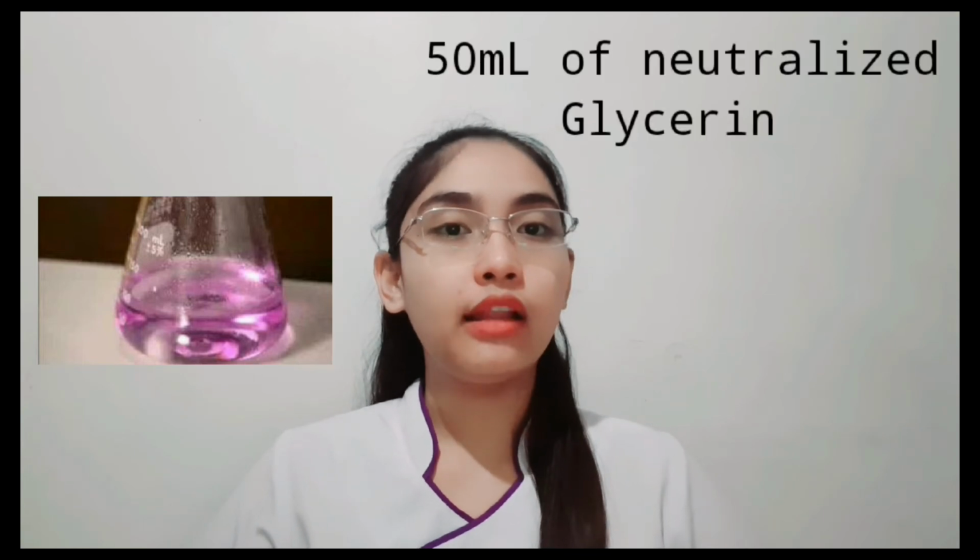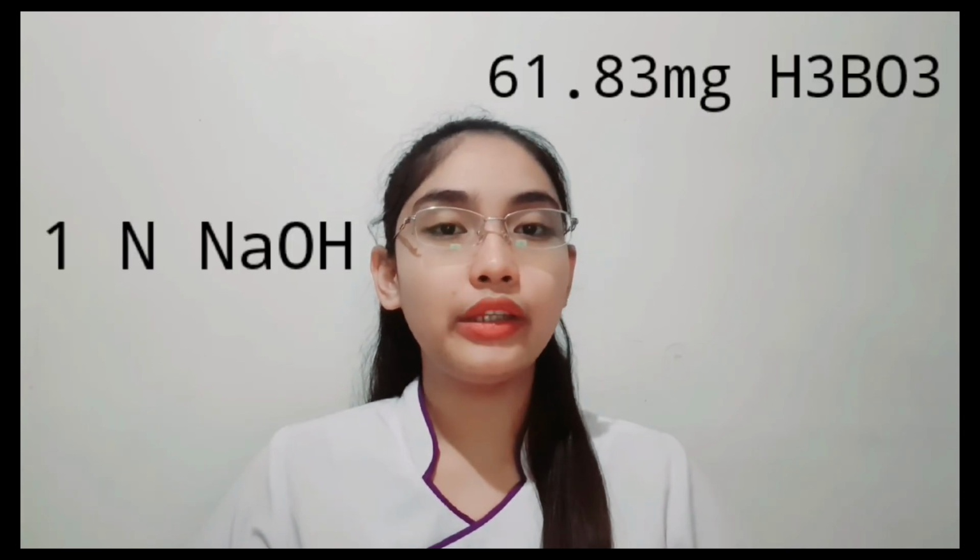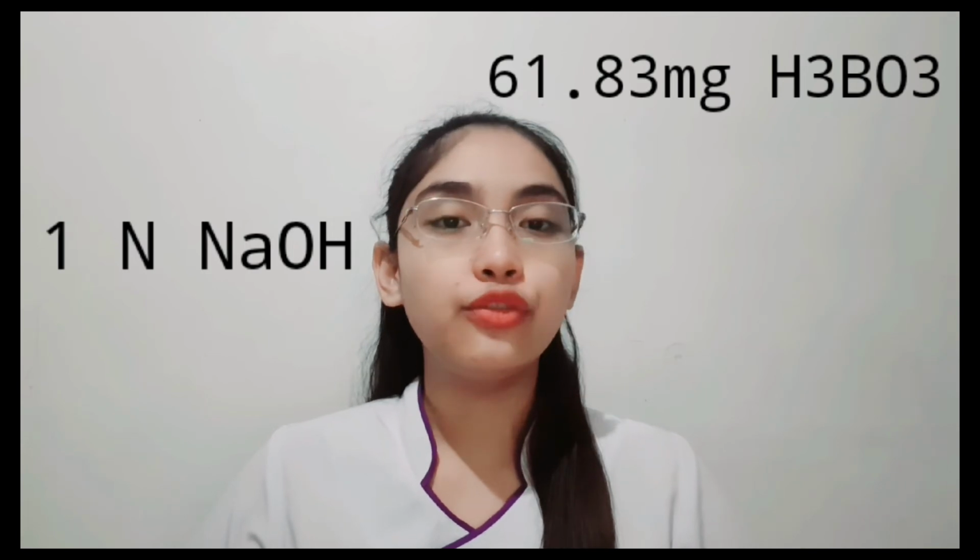Then remove the pink color by adding 50 ml of glycerin that has been neutralized with phenolphthalein TS, and continue the titration until the pink color reappears. Each 1 milliliter of 1N sodium hydroxide is equivalent to 61.83 mg of boric acid or H3BO3.